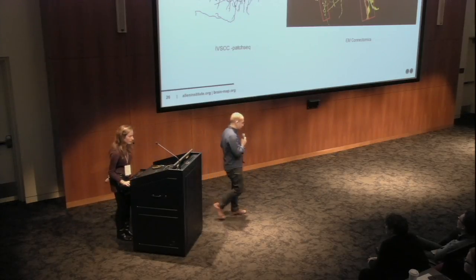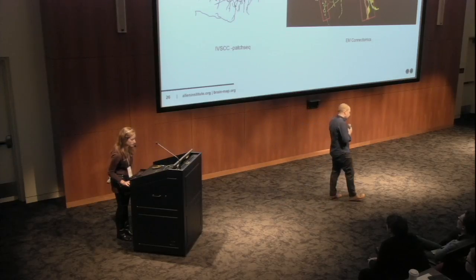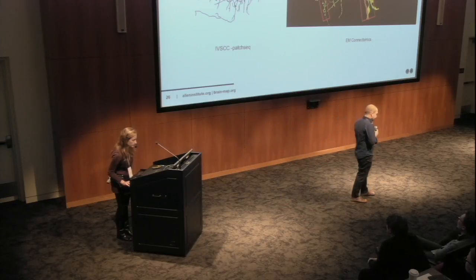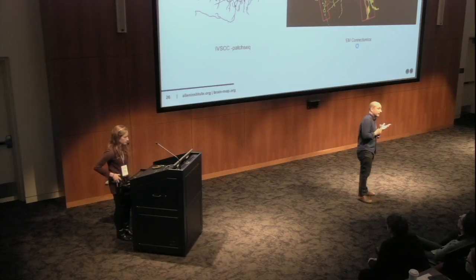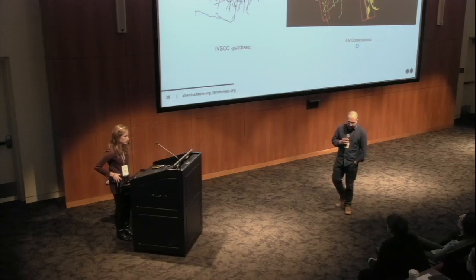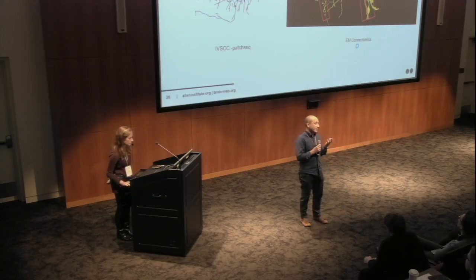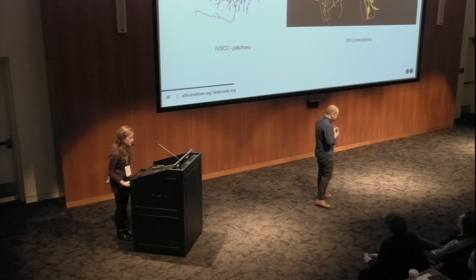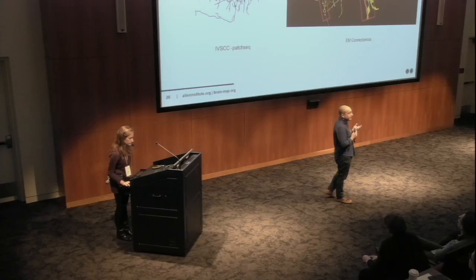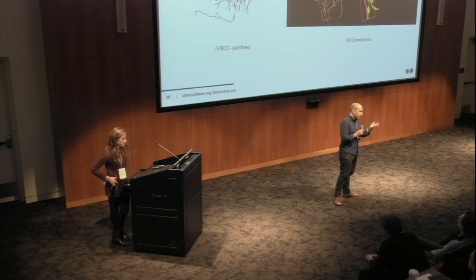So what you'll see is basically a similar video, a similar black and white simple image, but now thanks to a patient that donated his brain, and thanks to the surgeons in a local hospital, and above all thanks to Julie Nihus, who managed to get the sample within 6 minutes from being a block of tissue sitting in a brain like our own to being in a fixative.